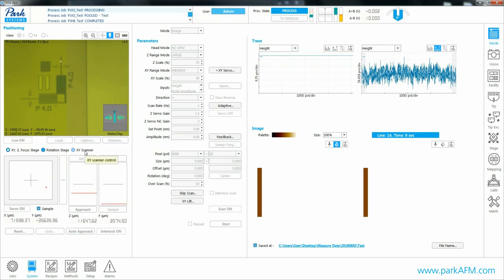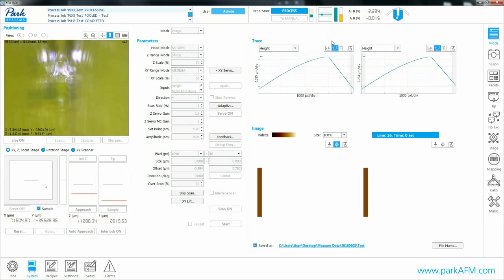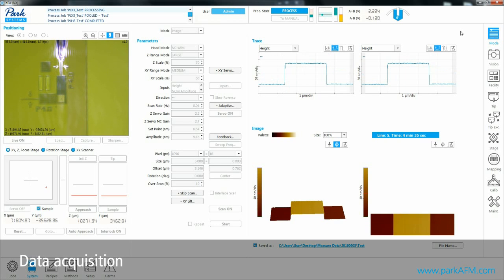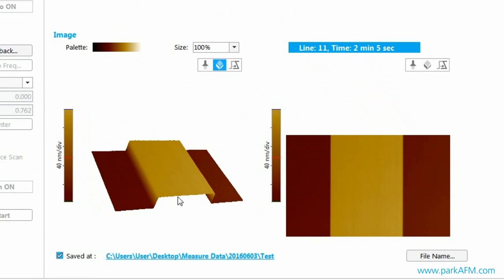The exact area specified in the recipe is targeted and scanning begins. This scan will reveal several sample characteristics such as shape, height, and roughness with nanoscale precision.